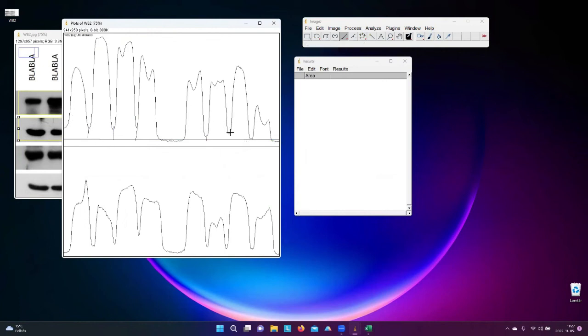But if you take a look at this figure, it looks like I closed almost everything, right? And then I'm going to use my magic wand to do the integration. I'm going to click. Wait, why is it so yellow everywhere? That happens, which means that you did not close properly the area that you want to use for the calculation. Here it is okay, and here as well, and here okay, and that's fine. But here again, so now I get only just 6 values.